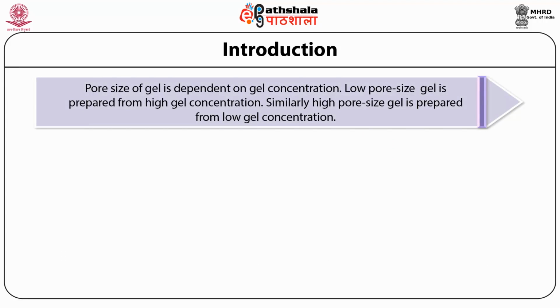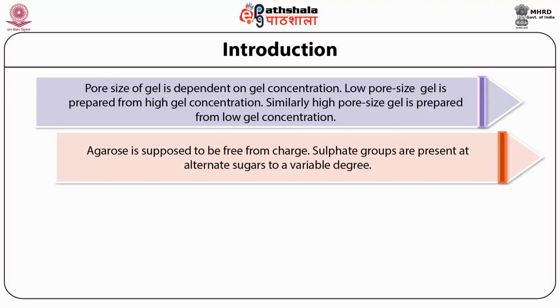Pore size of the gel is dependent on agarose concentration. Gel formed from higher agarose concentration will be of low pore size and vice versa. Although agarose is supposed to be free from charge, sulfate groups are present at alternate sugars to a variable degree.